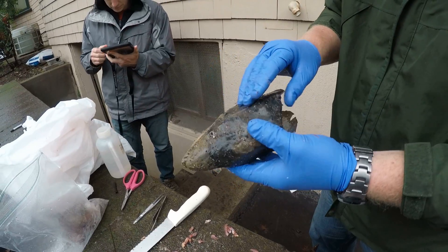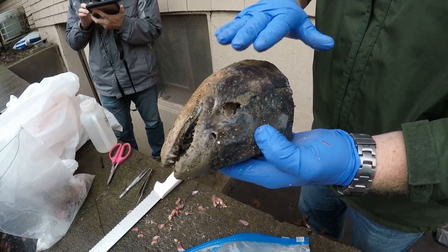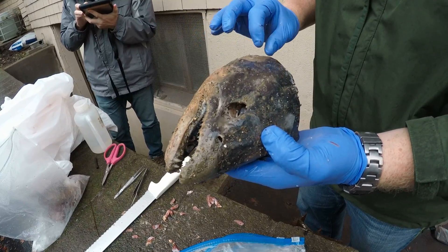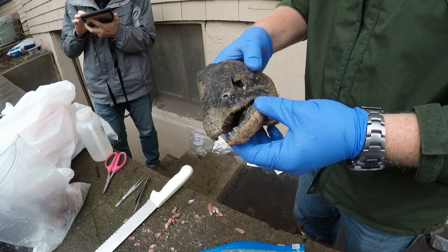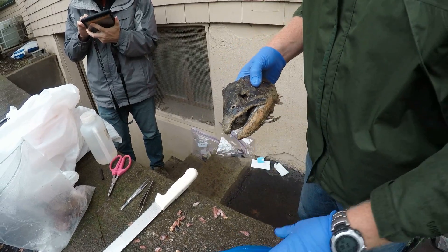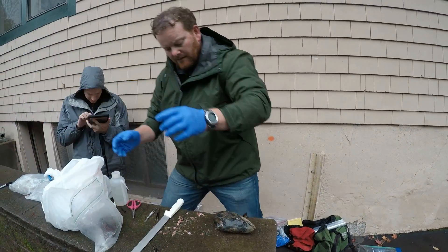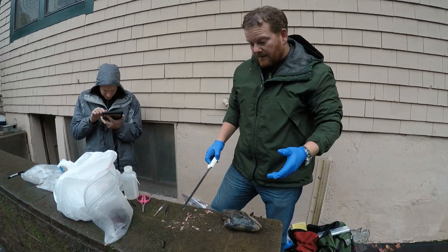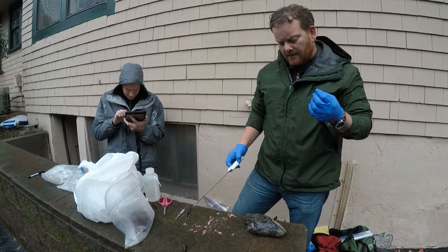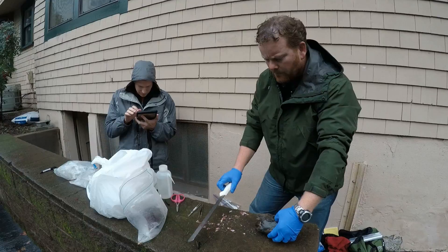What we're going to collect here is a genetic sample. We collect that from the operculum, the gill protective flap on these fish. Then we're going to saw into the skull and extract the otolith. The otolith is a structure involved with balance — it's in the inner ear. It's comprised of calcium, and what we do is look at the chemistry of that structure to determine where the fish came from, where it was actually born.